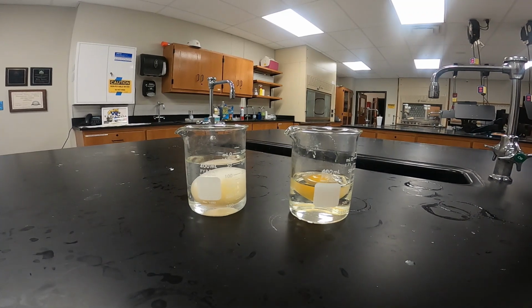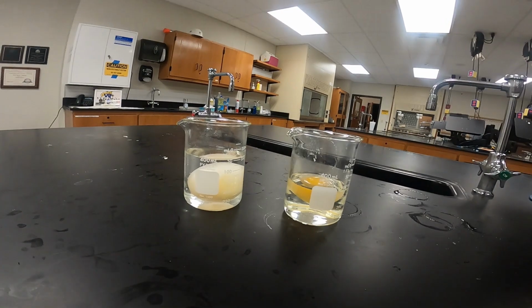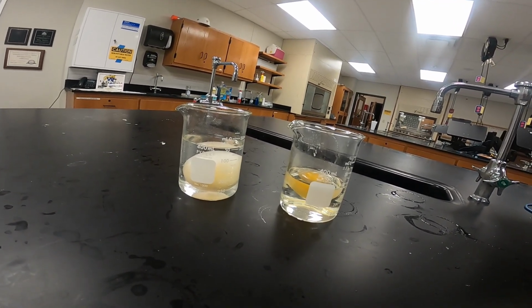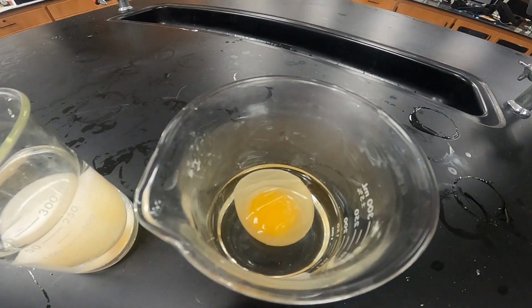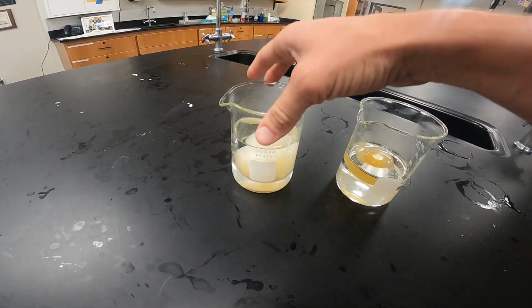So here we are. It's been over the weekend, so it's actually been about 72 hours. You would expect similar results after 24 hours. But if we look at our eggs, we have our egg that was placed in the water and our egg that was placed in the corn syrup. We're going to take each one over to the scale and weigh it and get our final mass.